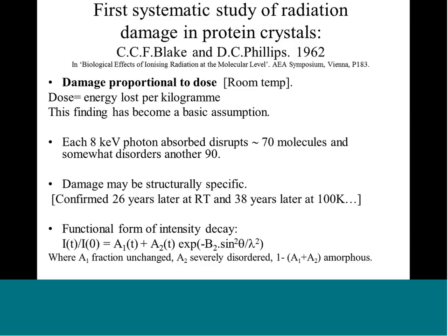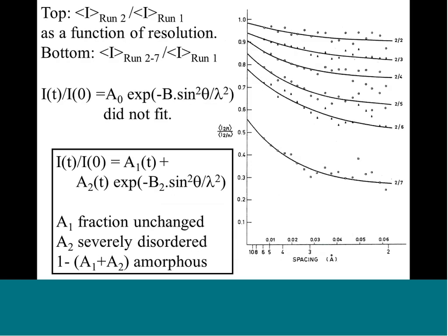They monitored a few reflections and took some datasets over a resolution range, which is the x-axis. You can see that they divided their second dataset by the first, then the third by the second, and so on, and saw gradually that the high resolution data damaged faster — the intensity went down faster than it did at low resolution — and they came up with this model.